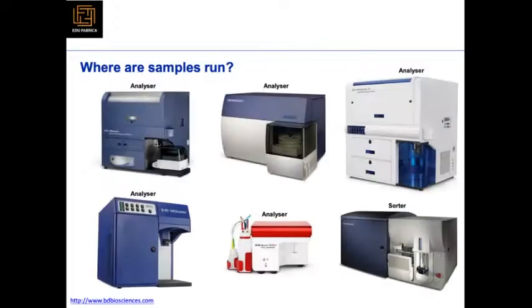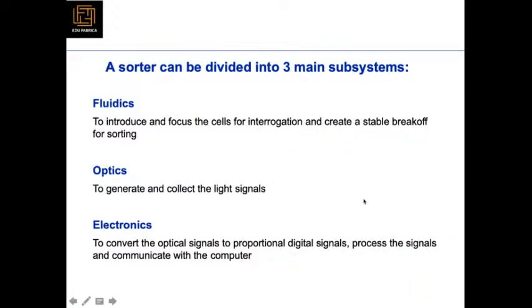They help in forward and side scattering, both ways of doing it. Each has its own ease of use. Here, if you put your samples in the tubes, one sample is possible at once. Here multiple samples are possible. This is, I think, the most mobile machine, possible for lower-level settings where FACS is not used so much. So each one has its own applications.